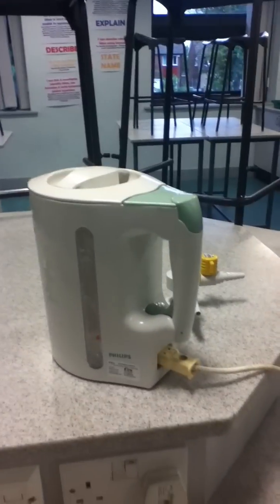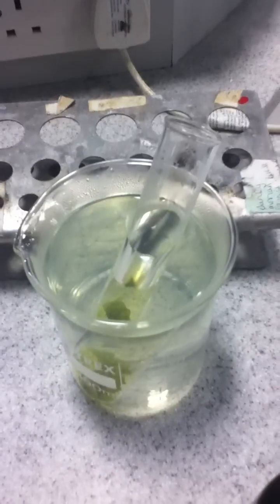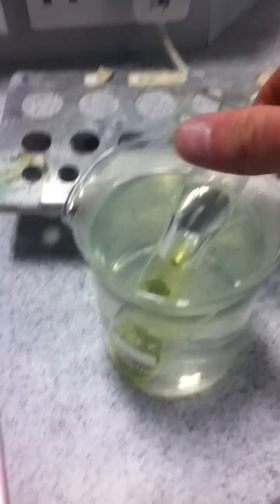So to summarise: boil the water, leaf in boiling water for a few minutes until it goes soggy, then leaf into ethanol and ethanol into boiling water, then leaf out of the ethanol and onto the tile, a bit of iodine, and there you go.